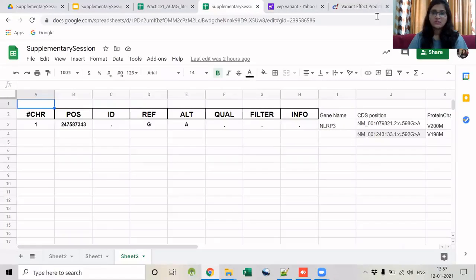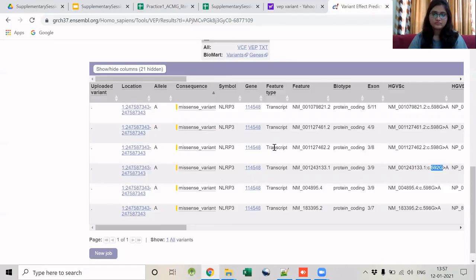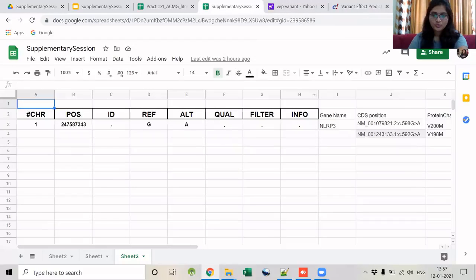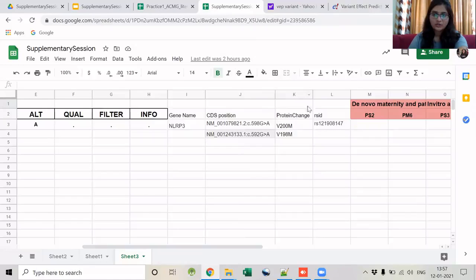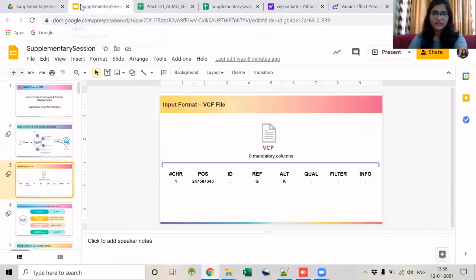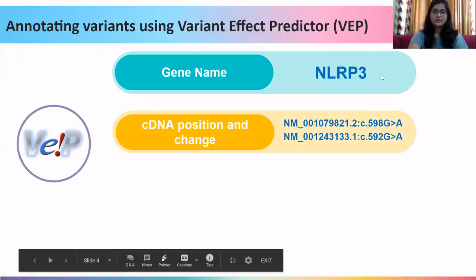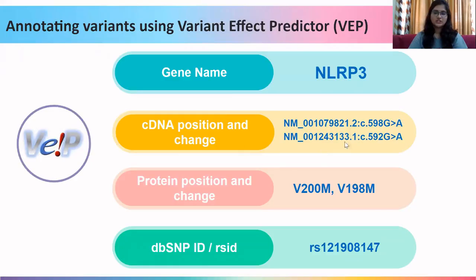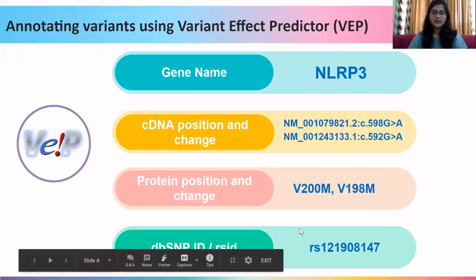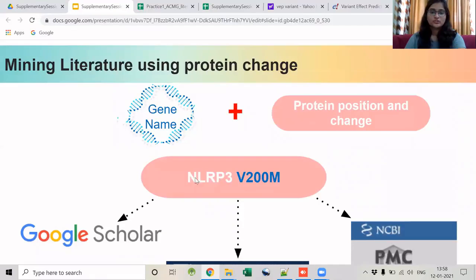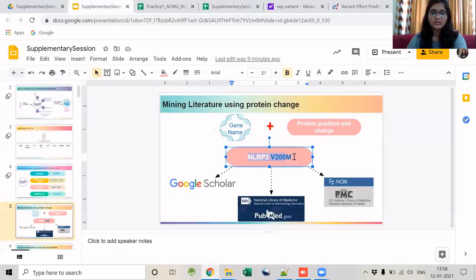The gene name given out by VEP was NLRP3. I have taken the two unique CDS positions and two unique protein changes, and also the RSID given out by VEP. We will use each of these details one by one to annotate this variant. The first thing we will do is use the gene name and protein position to annotate.